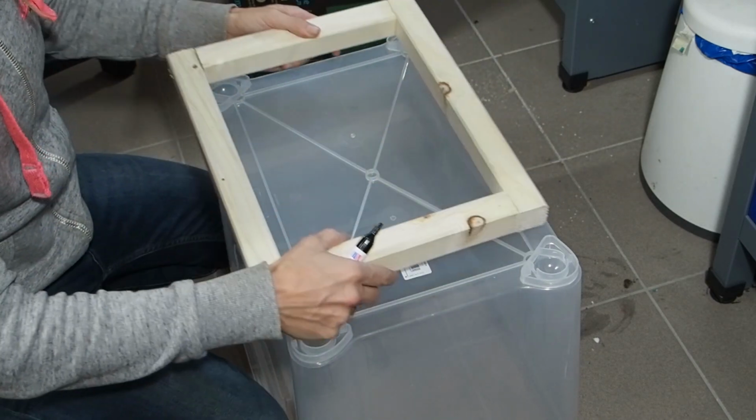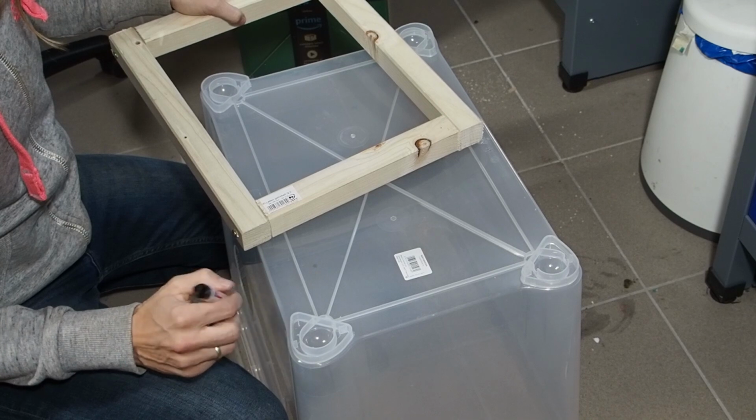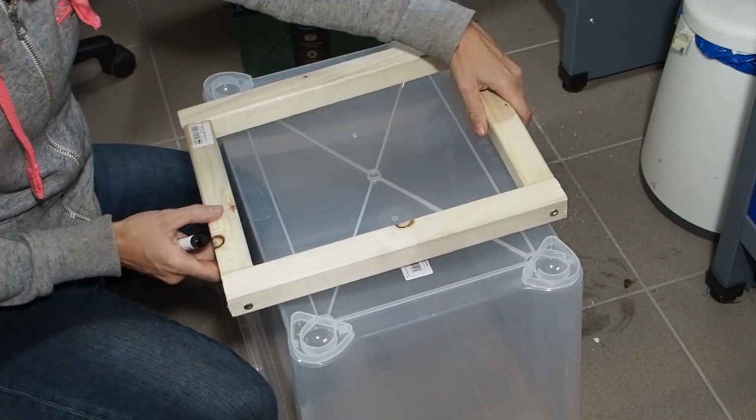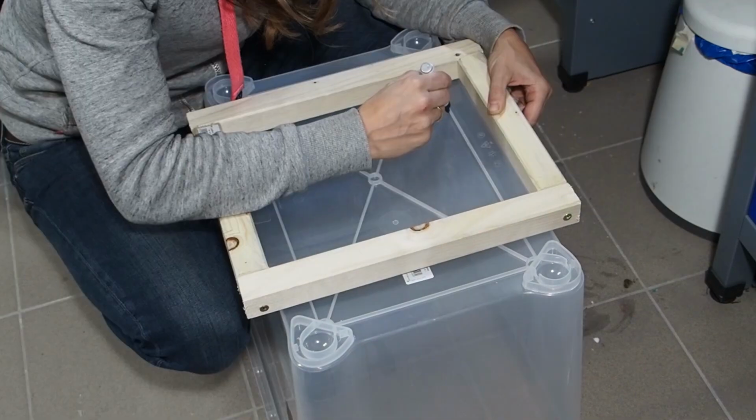So unfortunately the frame doesn't fit this way, because I have some feet here of the box, but I can mount the frame like this, it's no problem.